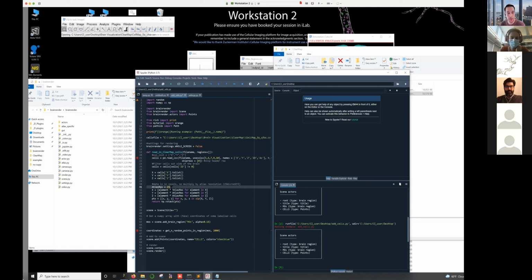So we do all the analysis in ClearMap at 25 micron isotropic. In the spinal cord work we actually use a non-isotropic resolution, so we do 10 microns and 25 microns. Depending on what work you're doing, you just need to set here what the resolution is, because BrainRender is working with microns. It's not working with pixels. So these values are going to be pixel or voxel coordinates, and BrainRender is expecting an actual position in microns. So we just need to multiply everything in these arrays by the resolution. In these lines here, we're saying, for every element in that array of X, multiply it by 25, and then update it.